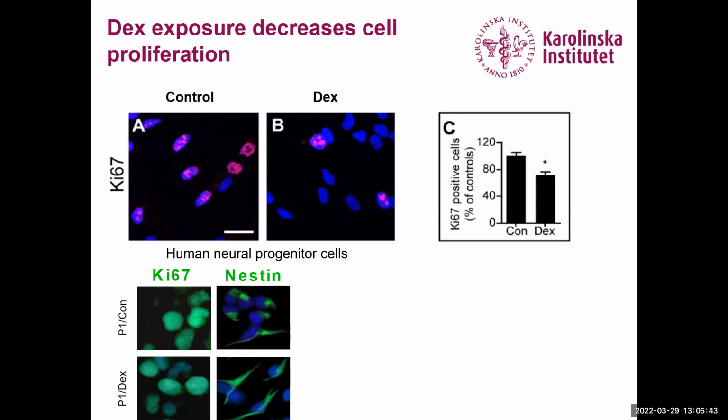I have a technical question. I have some clarification from you. Probably it will help the students. When you talk about the two questions, one by one, when you talk about washing, I would think the students should have asked: once you wash, why does the primary antibody not go off? And second, can the immunological studies or these stainings be used as a quantitative assay, or are they only qualitative?